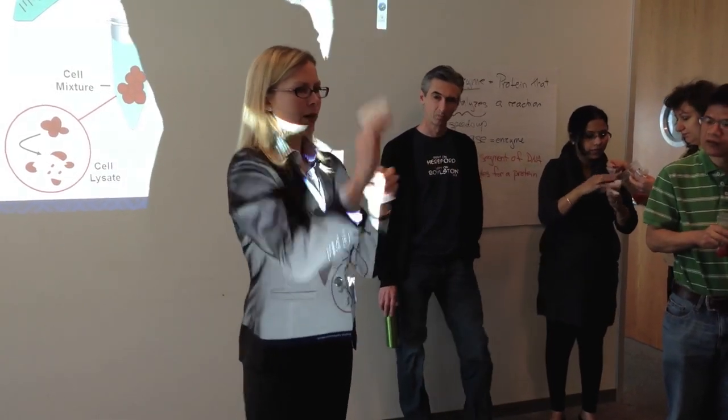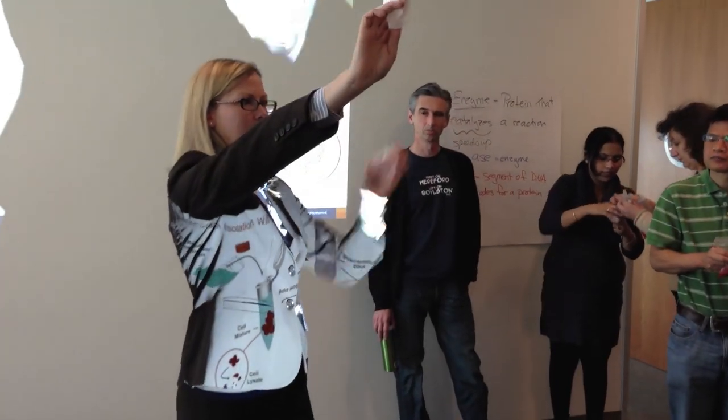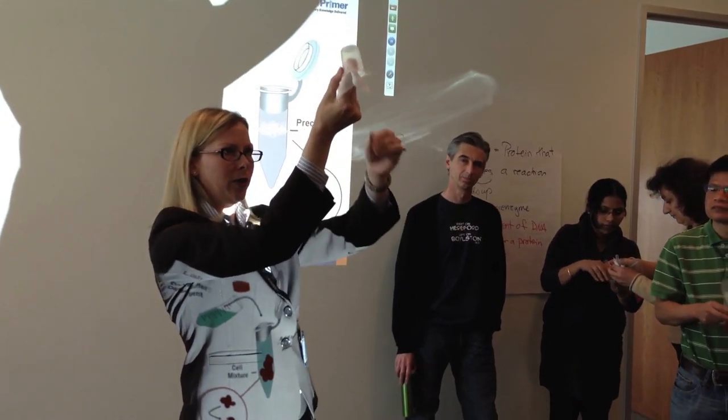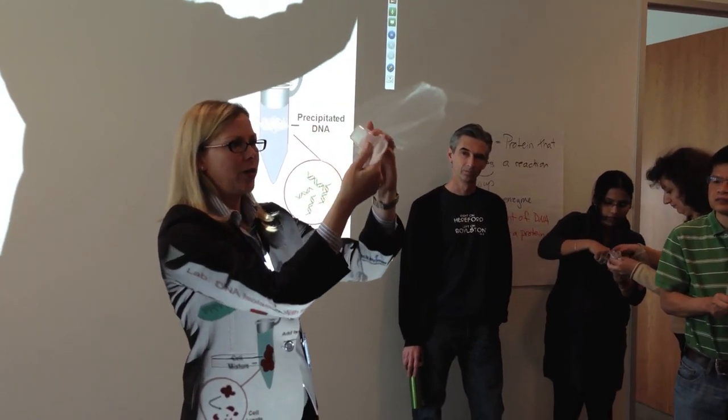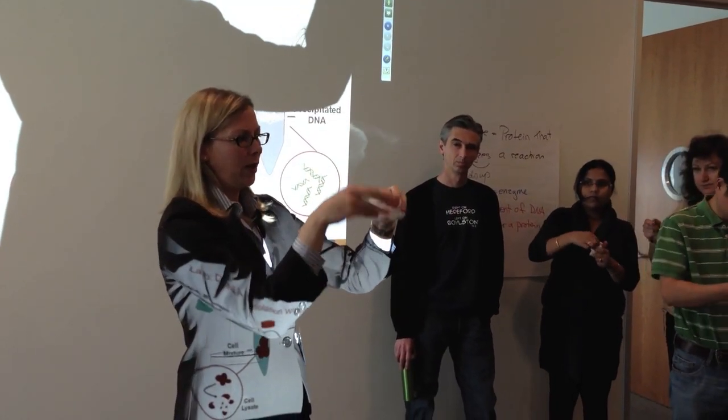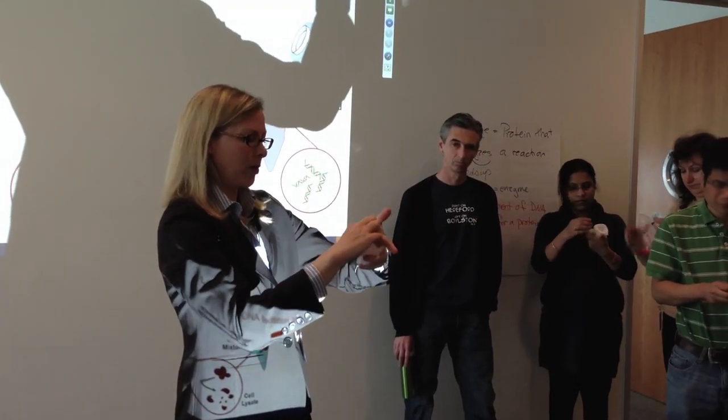What I do is I'm going to put the cheesecloth around two fingers, then go ahead and put those two fingers into the beaker, pull the cheesecloth around it, and then secure it with the rubber band. This is the hardest part of the experiment, really.